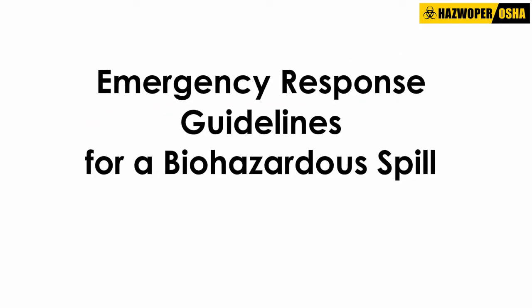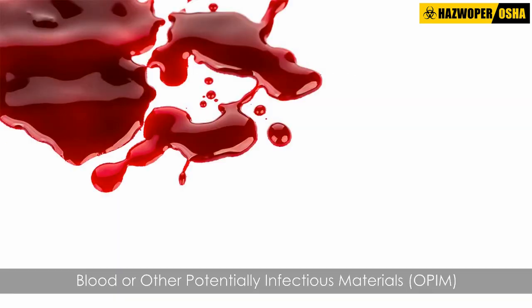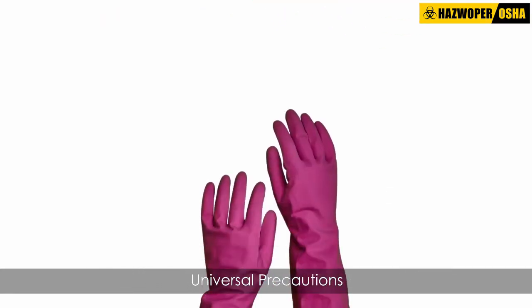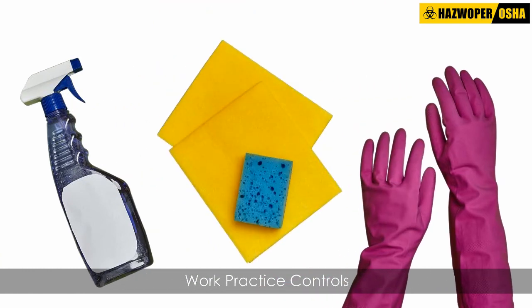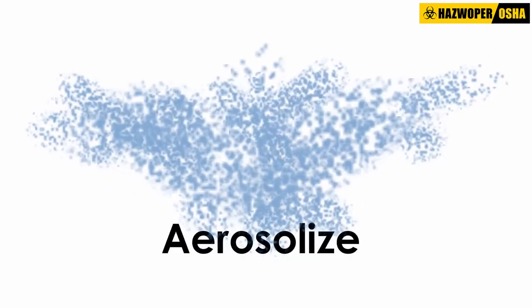Emergency response guidelines for a biohazardous spill. In an emergency situation that involves blood or other potentially infectious materials (OPIM), universal precautions and other engineering and work practice controls should be used to minimize exposure to infectious substances. In case of a spill of blood or any other potentially infectious material, care must be taken not to aerosolize the substance.